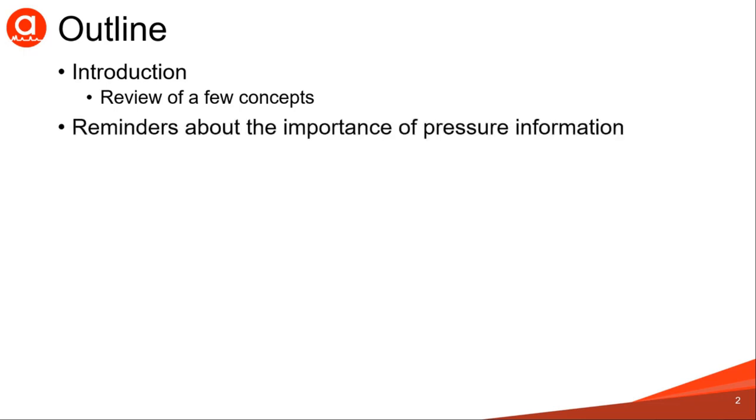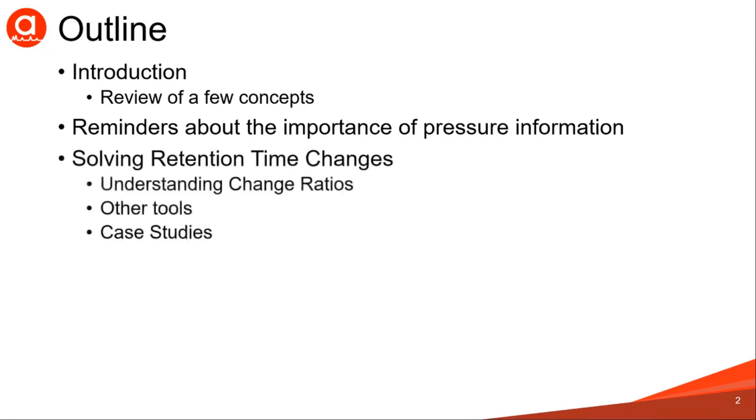Dwight has already covered the importance of pressure information, and we'd like to add to that. But we'll spend most of our time talking about solving retention time changes. We will introduce you to change ratios, give you some other tools, and then look at some case studies.